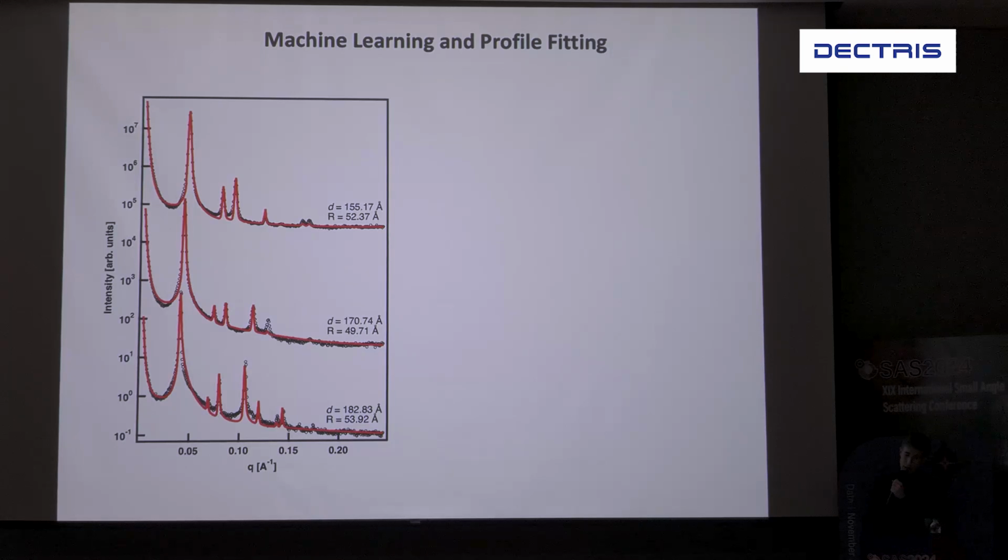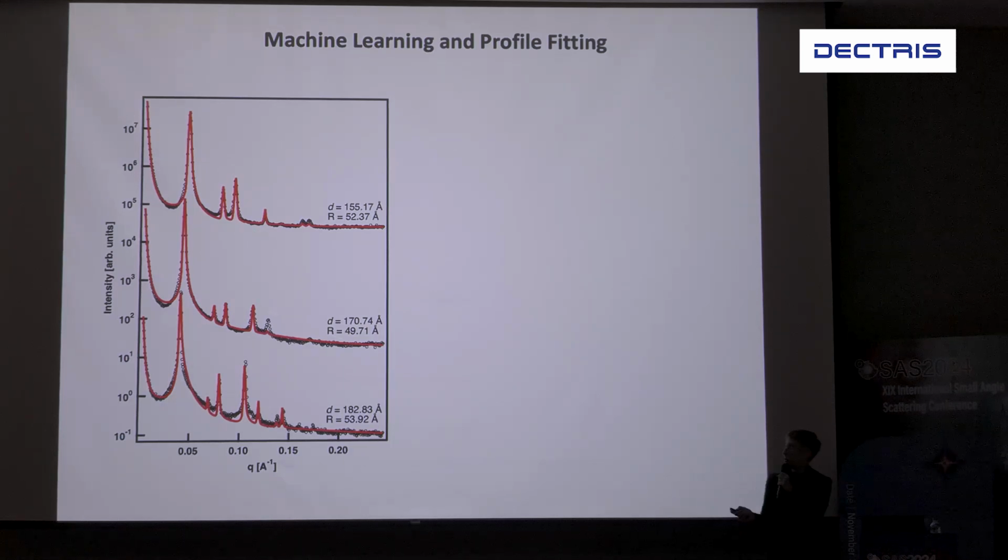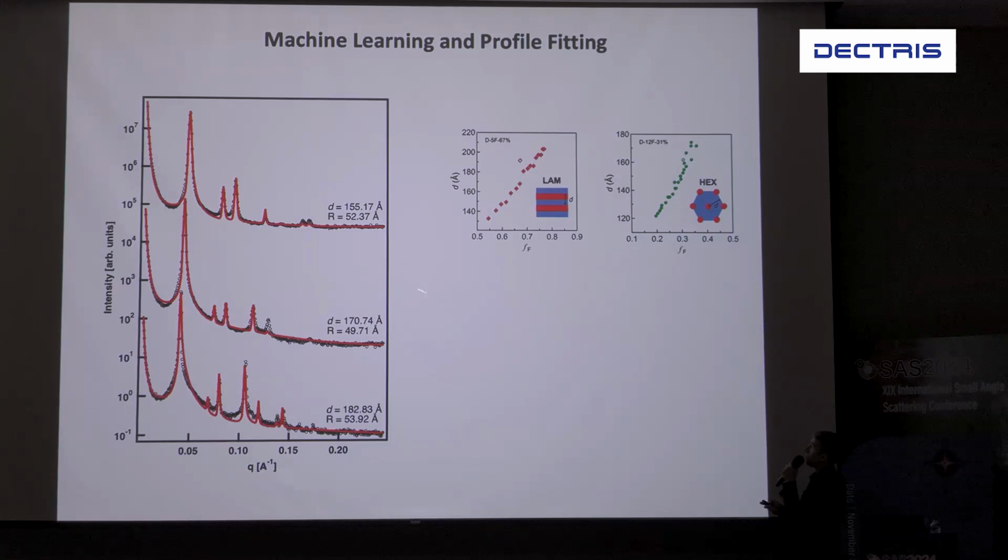Continuing with that, since I knew what phase it was, I also wrote some code to do line shape analysis. What you can see here is a hexagonal diblock copolymer, but the peak intensities are varying pretty largely. With the sharp peaks, I hypothesized that the reason some of these peaks are suppressed and modulated is due to the form factor of the channels within the diblock copolymer. With just a simple three-term model, I fit the first peak, set an exponential decay due to TDS, and then fit all the other peak intensities due to the radius of the channel. And you can see it fits very, very well.